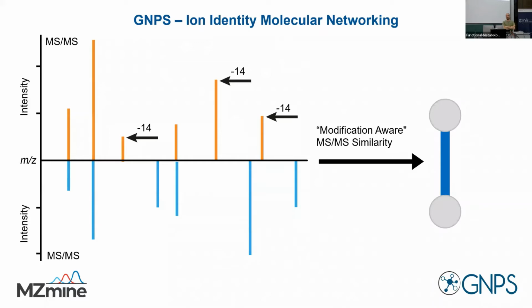We still have to, of course, figure out where the CH2 is located. It could also be something else, but the hope is that it's going to be two different compounds being connected in the network. And then, as I said, the graphs get quite complex, and then we can try to traverse the graph and make some sense out of what we already know and discover the unknown.